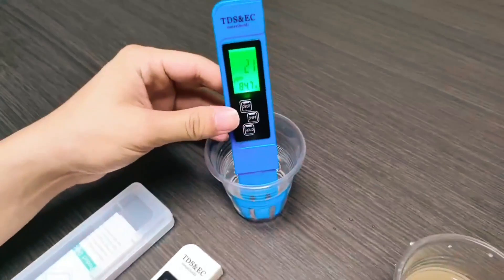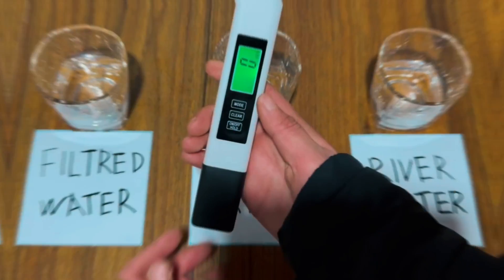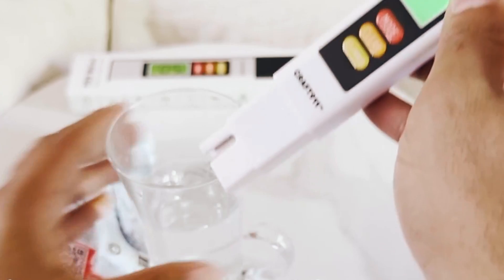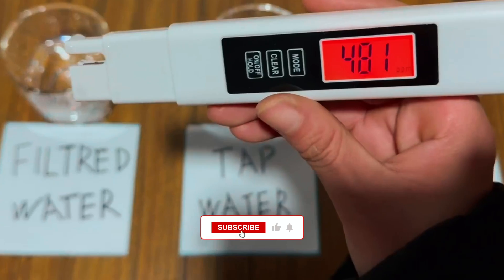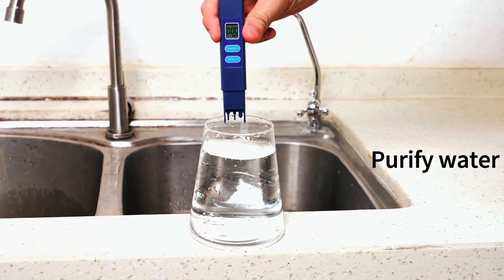If you're serious about monitoring your drinking water quality, a TDS water tester is a must-have tool. In this video, we'll walk you through five of the best TDS meters available on Amazon, each selected for its accuracy, ease of use, and overall value. Whether you're testing tap water, filtered water, or even your aquarium or hydroponic setup, these devices will give you fast, reliable results.